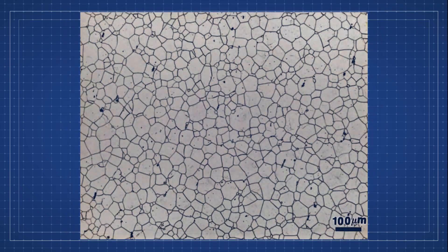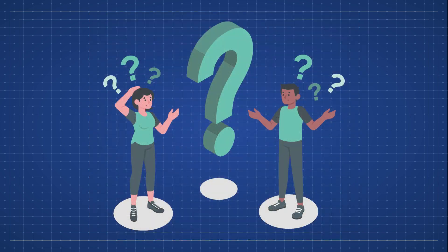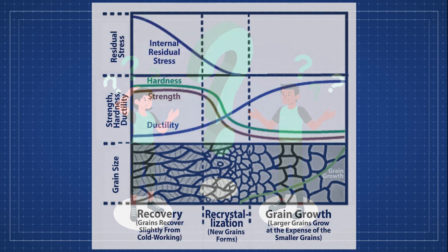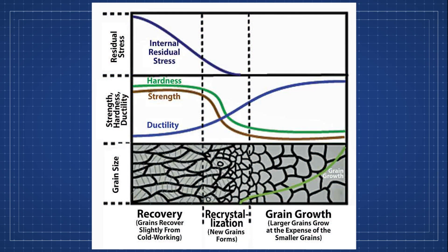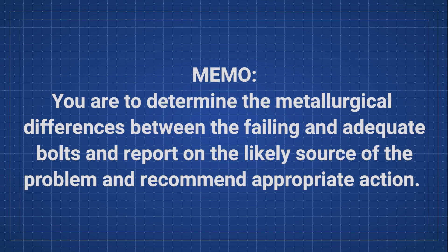After finding the grain size of each of the bolts, you will then determine how the hardness of each bolt relates to their grain size. After doing this, you will be able to make a better conclusion as to what the company should do regarding their failing bolts. In your memo, you are to determine the metallurgical differences between the failing and adequate bolts and report on the likely source of the problem and recommend an appropriate action.